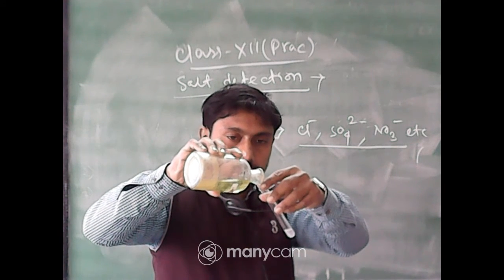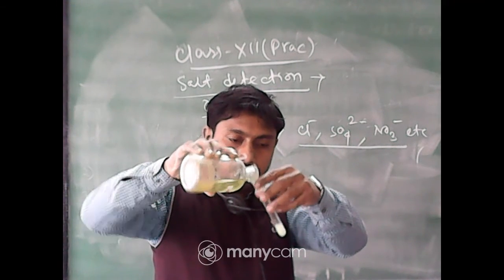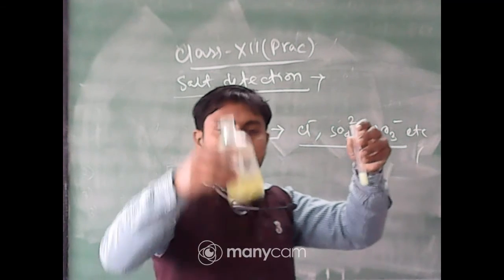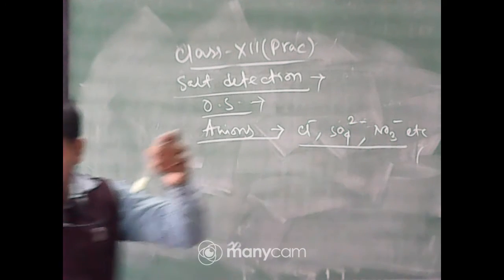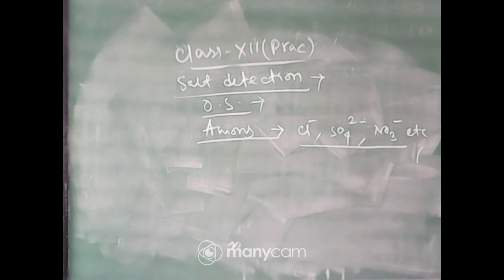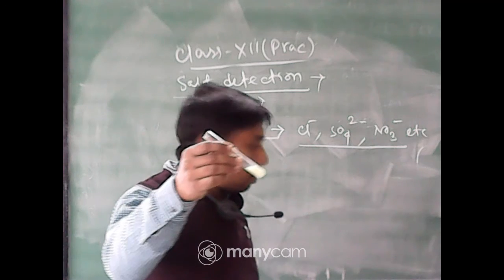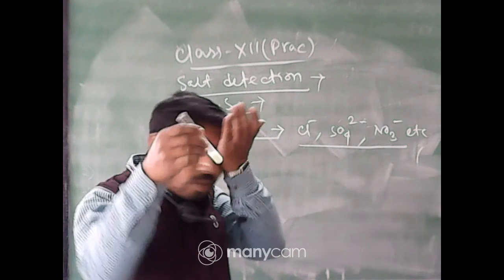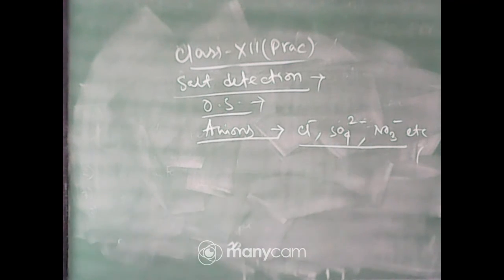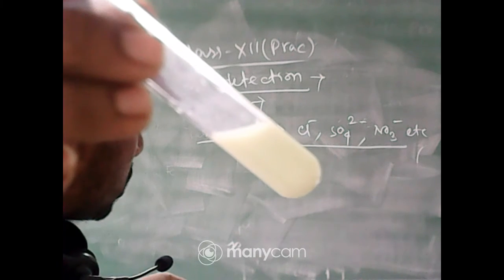Now look at that. This is the potassium ferrocyanide solution. As it is just yellowish, here you can see the PPT is a bluish white, a bluish color, or white but not so... just look at that PPT. Okay. So this is the PPT formed.